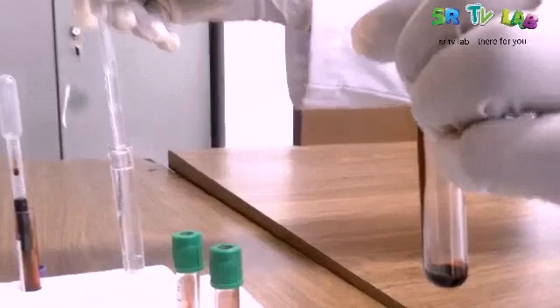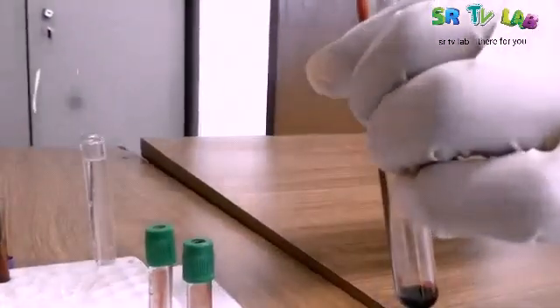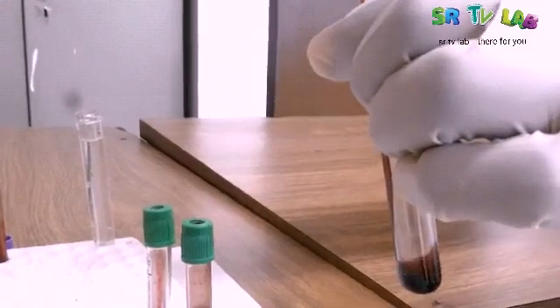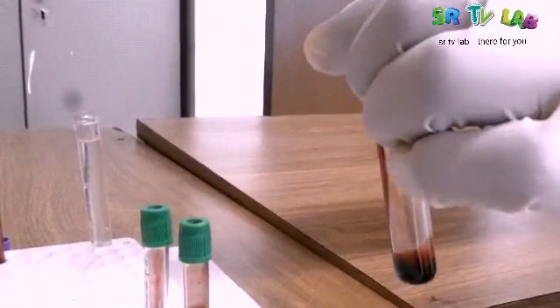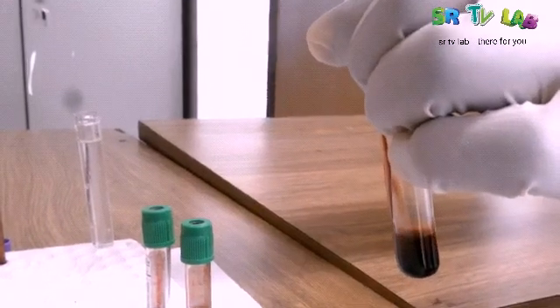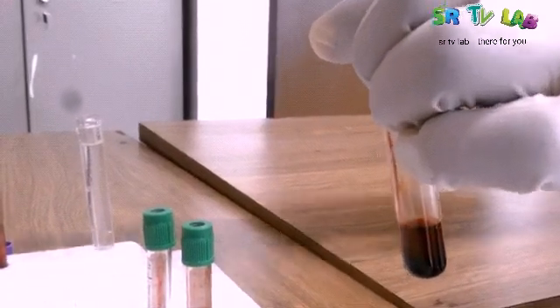Now let's draw some water and then add it into the sample of red blood cells. And then we will check. We are expecting to see a translucent red color.